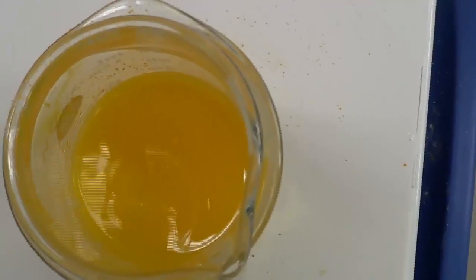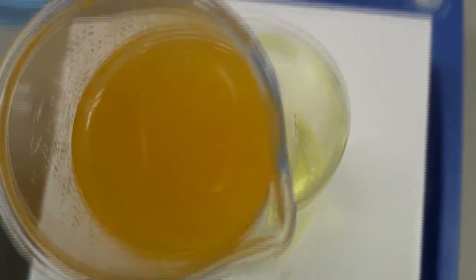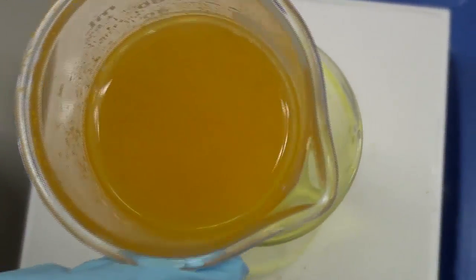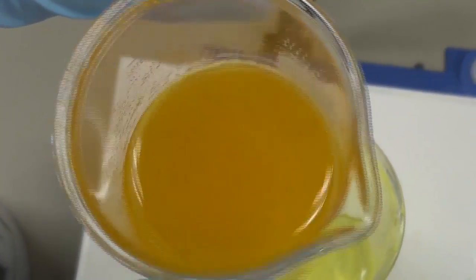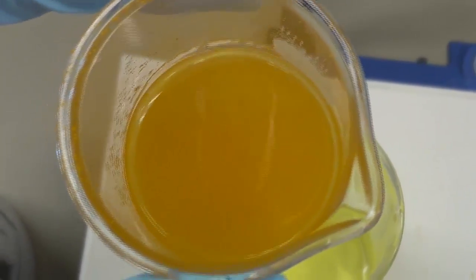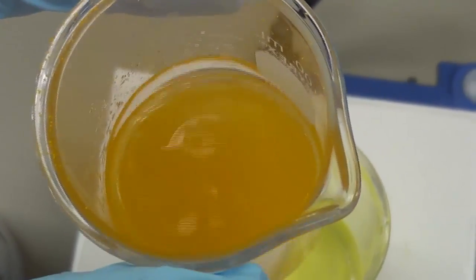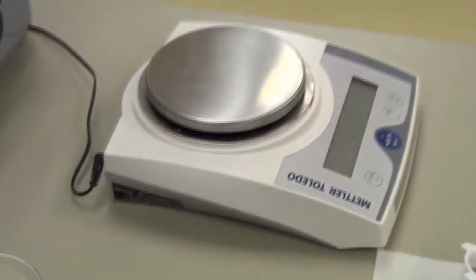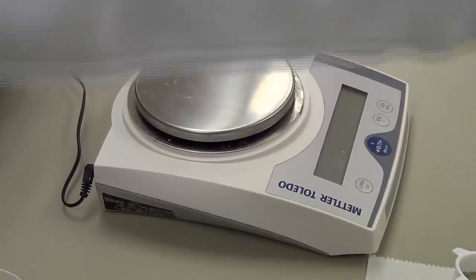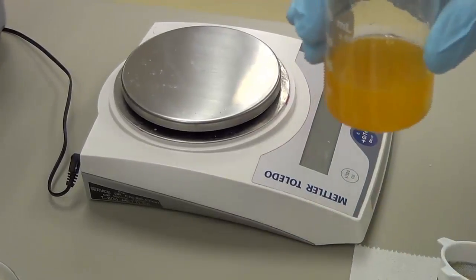Let me stop the stirring here. Can you notice clearly that I can see the particles over there? Because this is a suspension now. This is a suspension because the drug is insoluble in this troche base, so it's literally a suspension. What is the right time to pour the suspension into the troche mold? It is when it's lukewarm, or baby bottle warm.